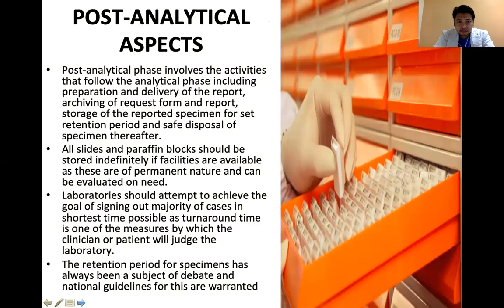Okay? Now let's go to the post-analytical aspects of histopath lab. Post-analytical phase involves the activities that follow the analytical phase, including preparation, delivery of the report, archiving of the request form, and report storage of the reported specimen for set retention period and safe disposal of specimen thereafter.